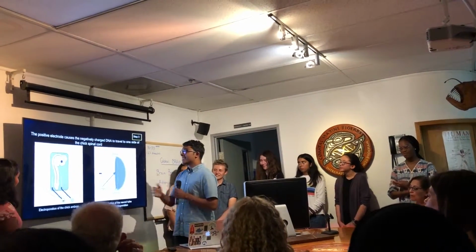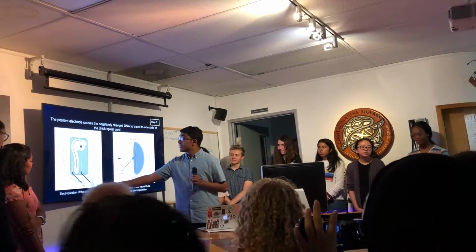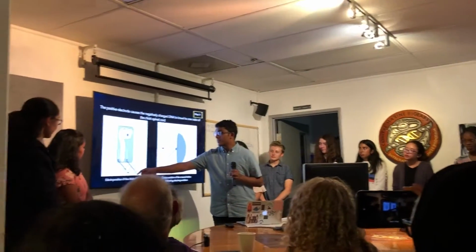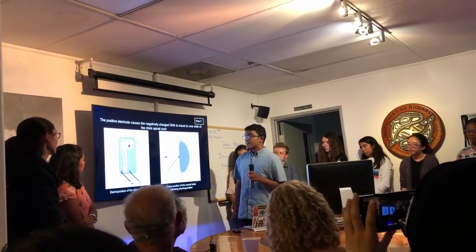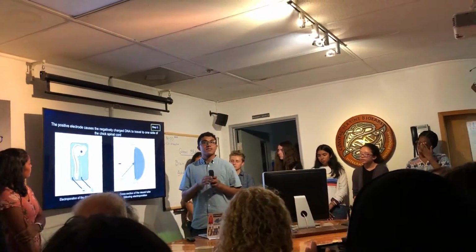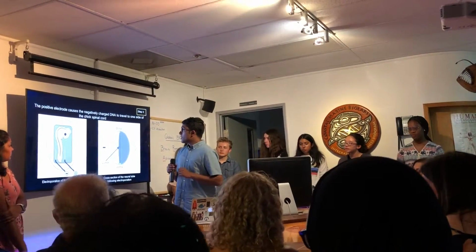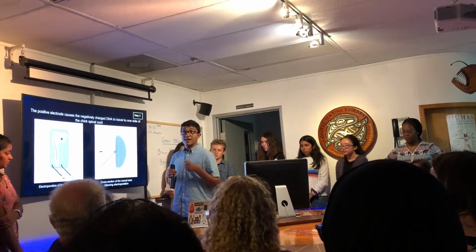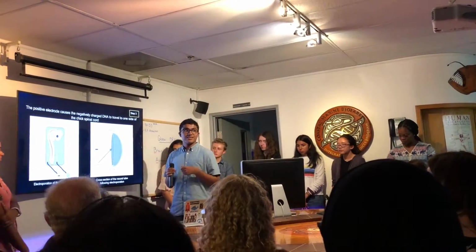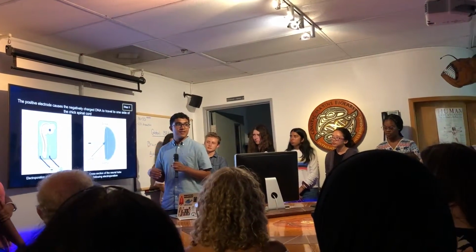Okay, so here is a top-down view of the electroporation. We have a positive electrode and a negative electrode, and they're placed near the caudal or tail region of the embryo. This is because we only want to visualize gene expression in the caudal region. To get the DNA inside of the spinal cord cells, we can take advantage of DNA's slightly negative charge.